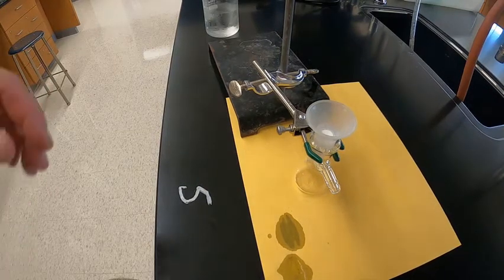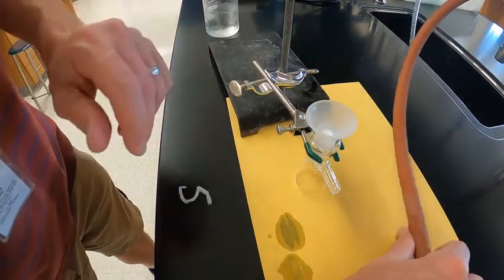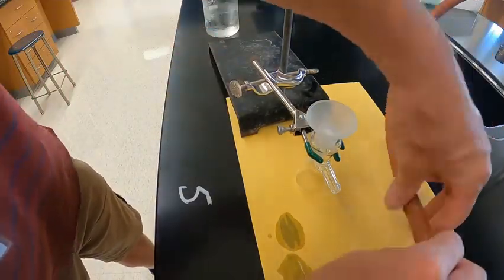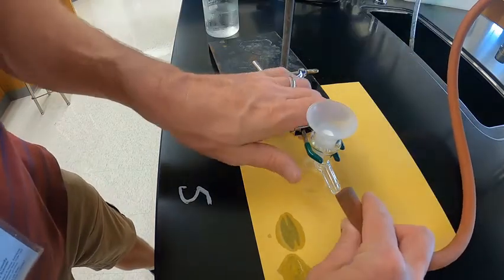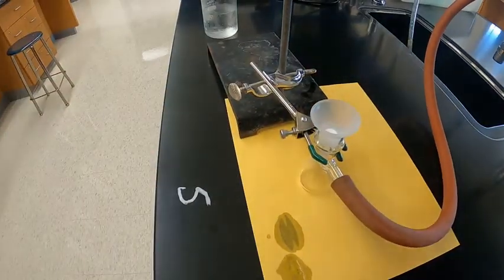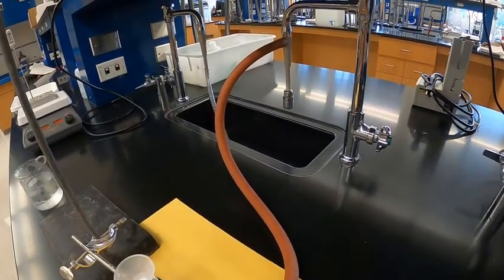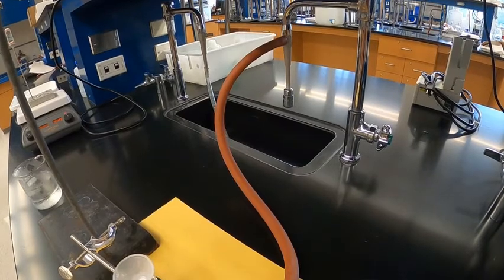So I'm going to hook up a hose that comes from the sink, and I have everything clamped so this won't tip over. So the hose connects to a vacuum sidearm setup of the sink head.